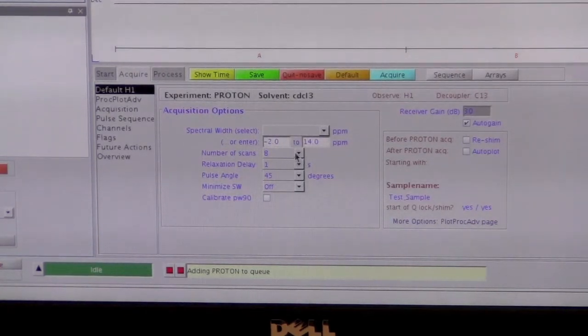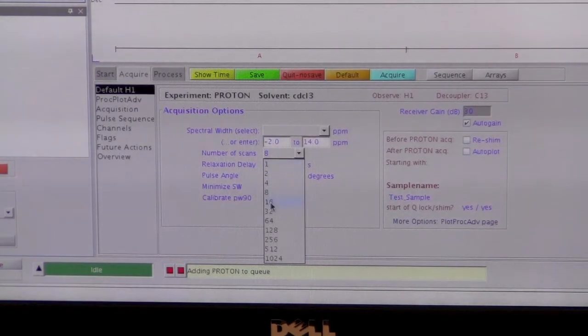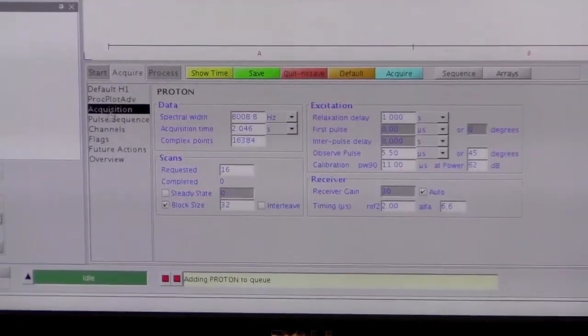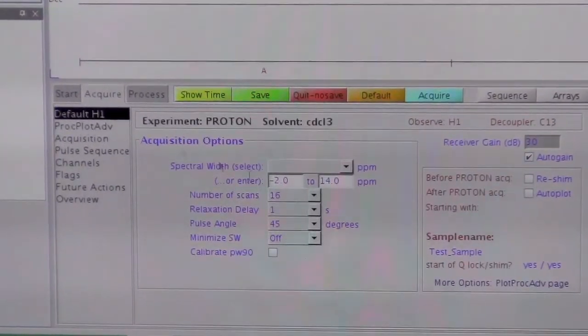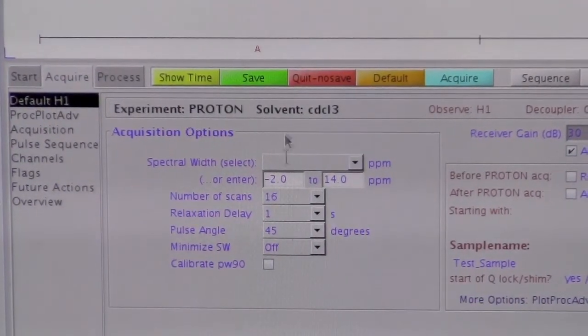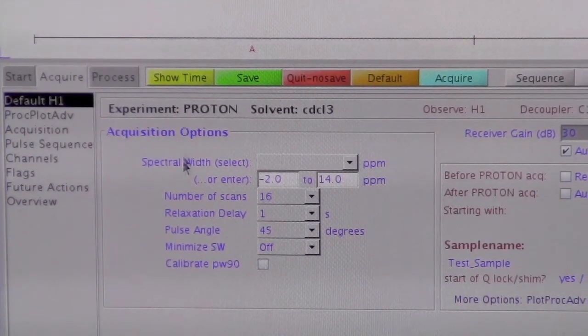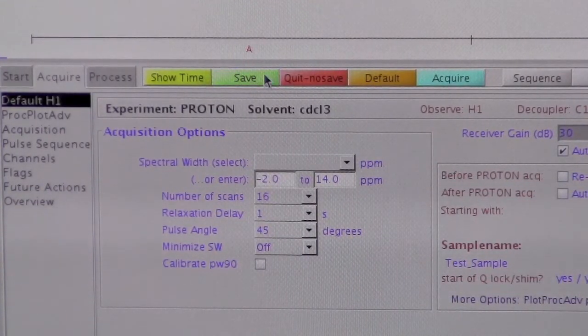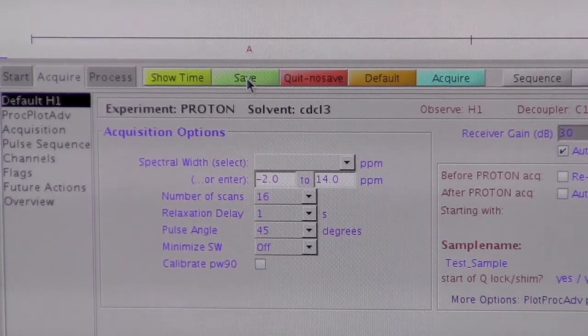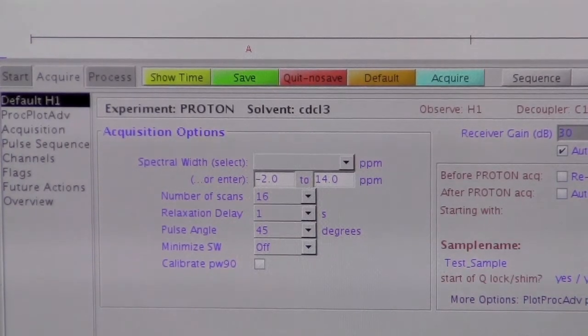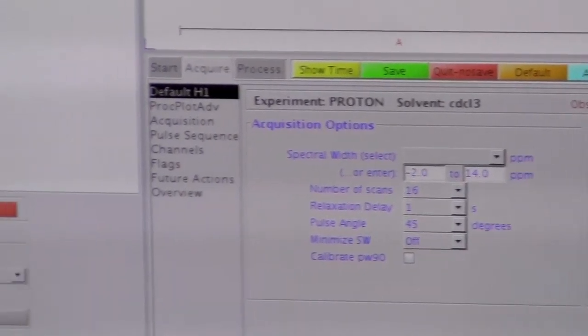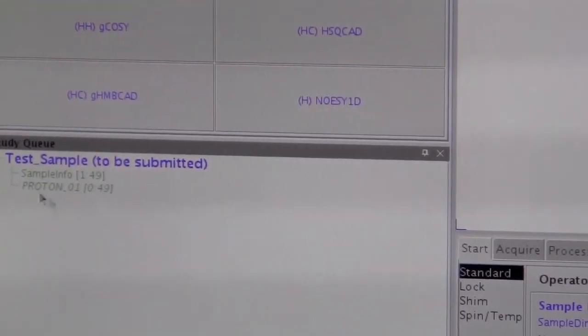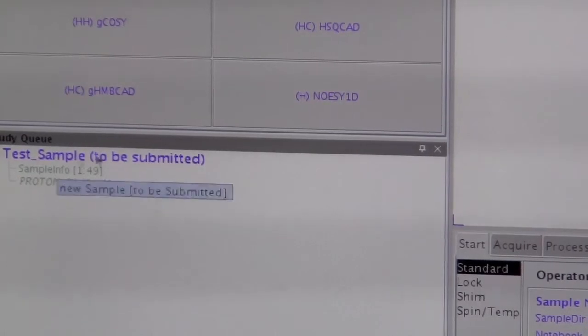So probably the main thing you want to change is the number of scans. So we could put in, for example, 16 scans. There are other things that could be changed here, but the default panel has the most common different options on it. If you made changes and you want to save those changes, you click on the green button here for save, and then it should update the screen over here, and since we changed the number of scans, it's going to update how much time it expects the experiment to take.